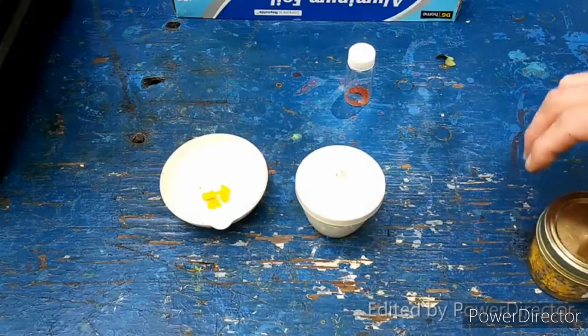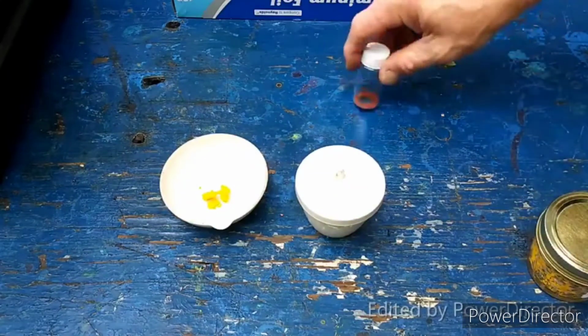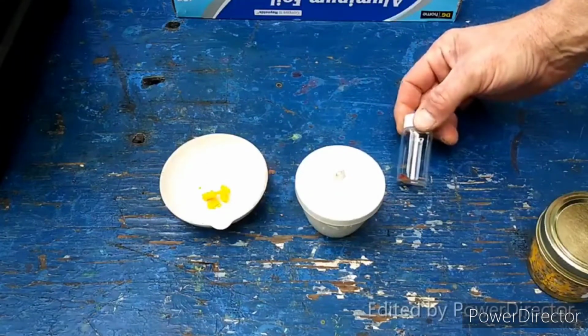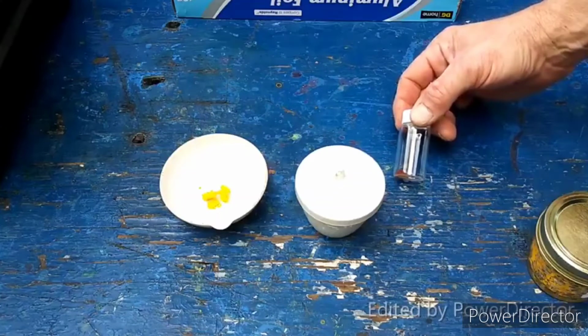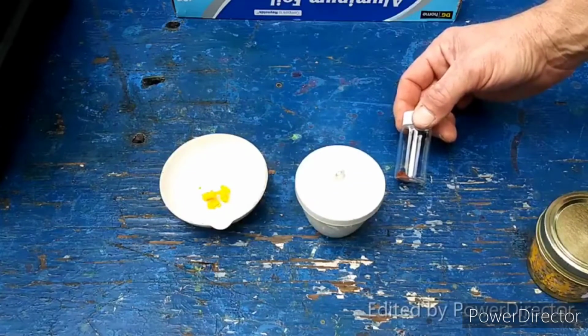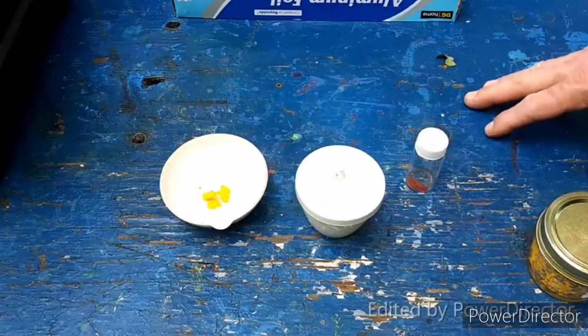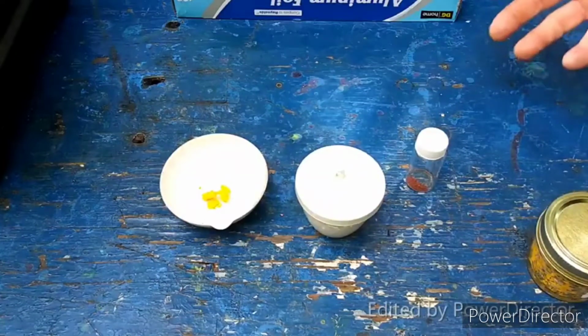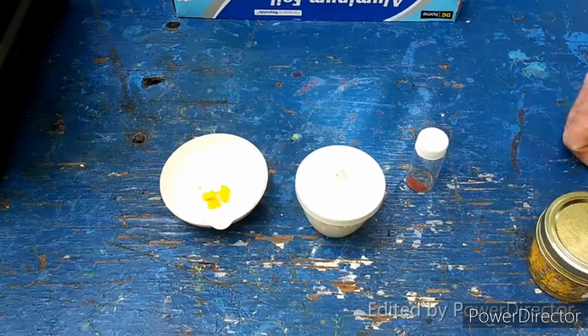So I need to make up a bigger batch of this stuff. I really would like to explore the peruranates more, but I need to get some ethanol, and I'd really like to get some stronger hydrogen peroxide, because with this 3% stuff you always end up with so much liquid afterwards. It's such a pain.